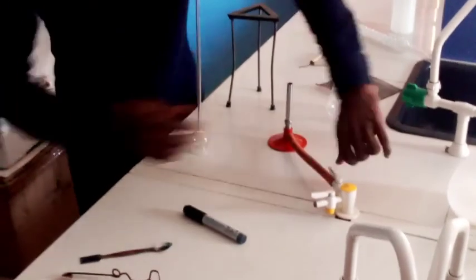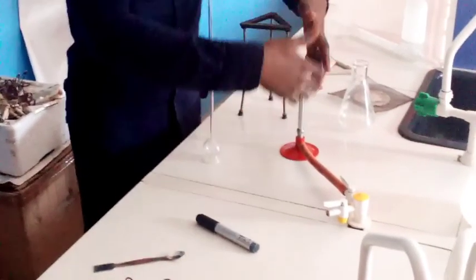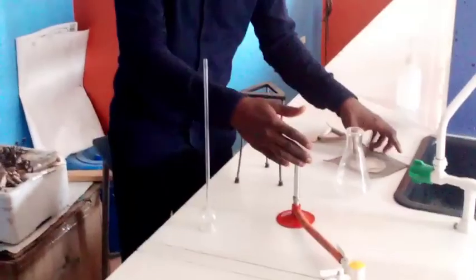This is how it looks. Bunsen burner for heating of substances. It is supplied with gas, the source of the fire. So you open this knob and you light it. Then you can use it to do what? To heat substances. This is Bunsen burner.